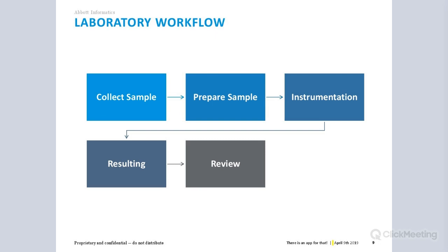Looking at this workflow, you can see the samples must be collected or received, prepared for analysis, run on instrumentation, have the results collected, and then reviewed for release. So the more tests that are required to be performed on the sample, the more complicated this workflow will become. Hence, what I was saying before, the more opportunity for workflow optimization.